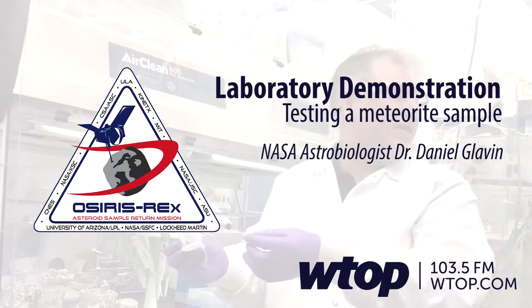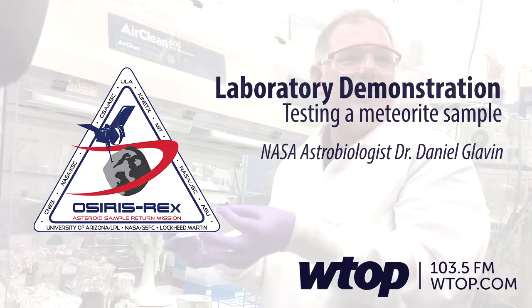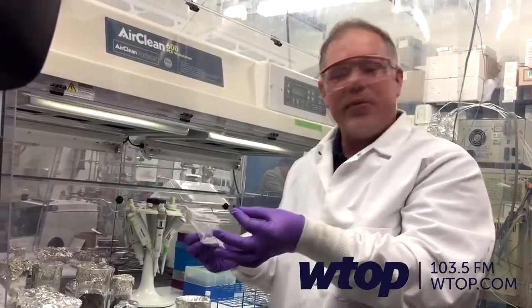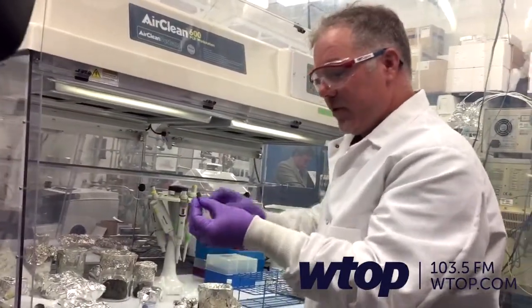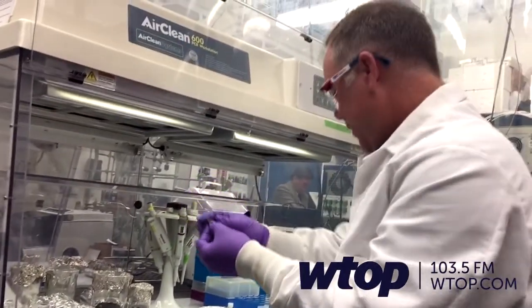It's been contaminated so I don't need to worry about touching it. We would never do this with the samples from Bennu — we would handle them with tweezers — but this one's just for practice. This is a carbonaceous meteorite chip here.